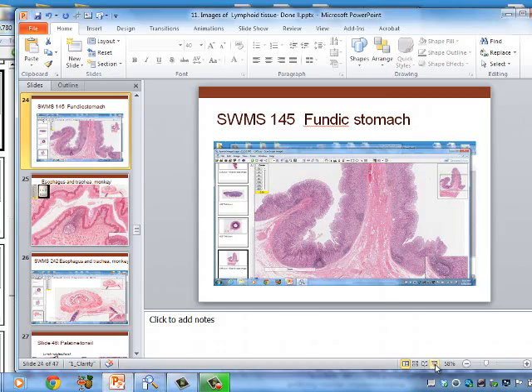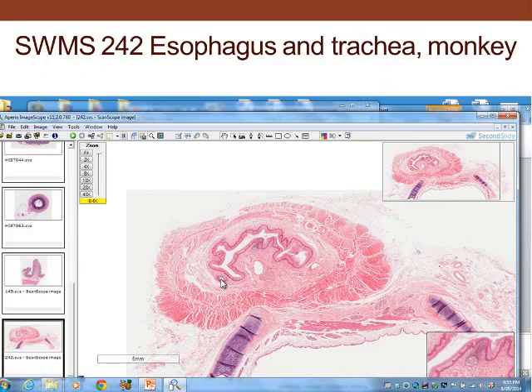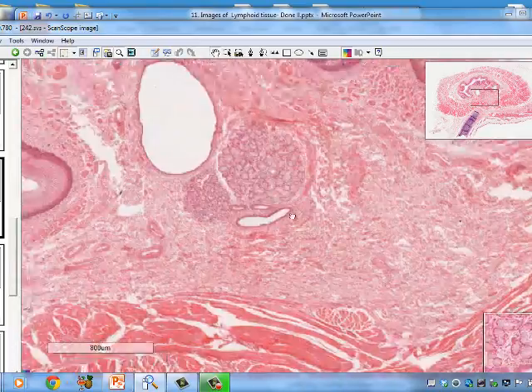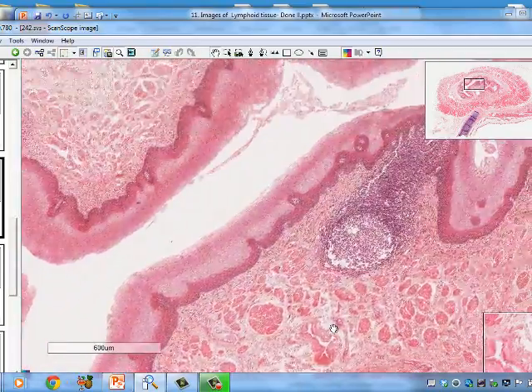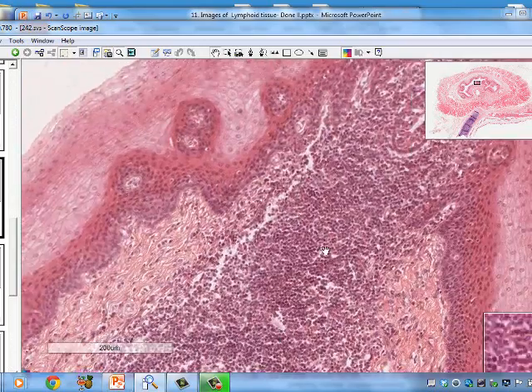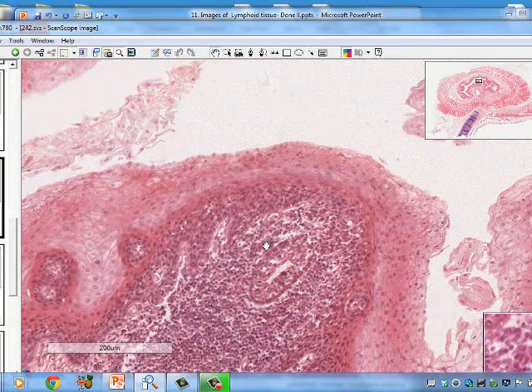So if we look at this again, that's the stomach, and then also in the esophagus. So you have lymphoidal tissue in the esophagus as well. So that's one of the things we want to look at, is the esophagus, and you can see the lymphoidal tissue here that's located with the germinal center, and many lymphocytes ultimately interacting with the surface that we have there.